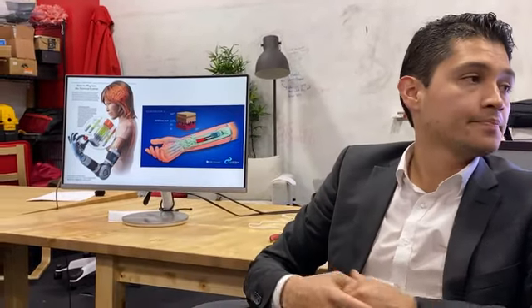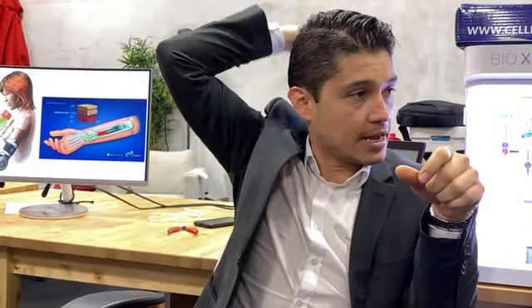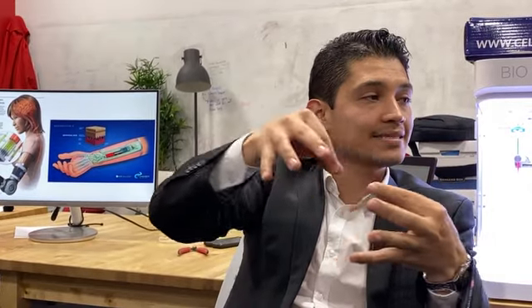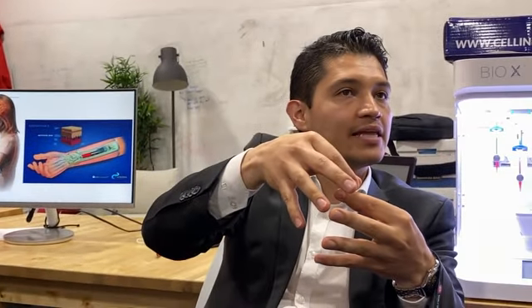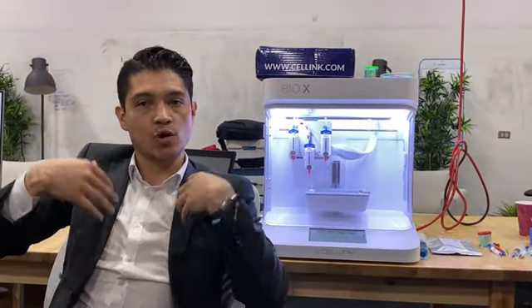Chris? Has anybody printed a functioning nerve segment yet? Nerve. I know that they have a wire already, but I don't know which kind of biomaterial technology, because nerve cells are particularly tricky. I know as well that they have built grafts with cells inside. Yeah, and they have tested that on animals, and they made a mouse that was paralyzed move again. Of course, I don't know if they have tested already in humans. I guess no.